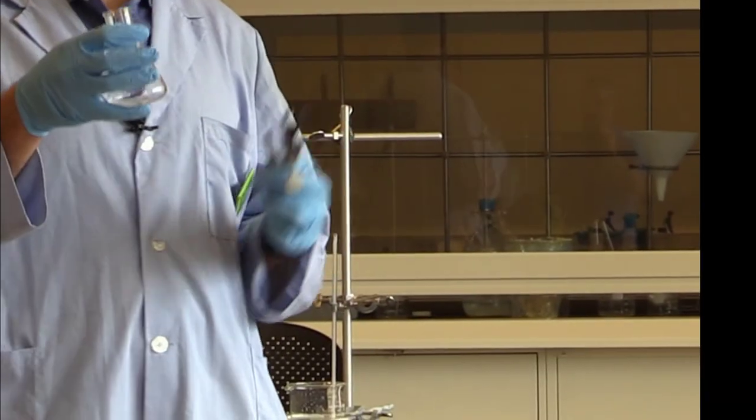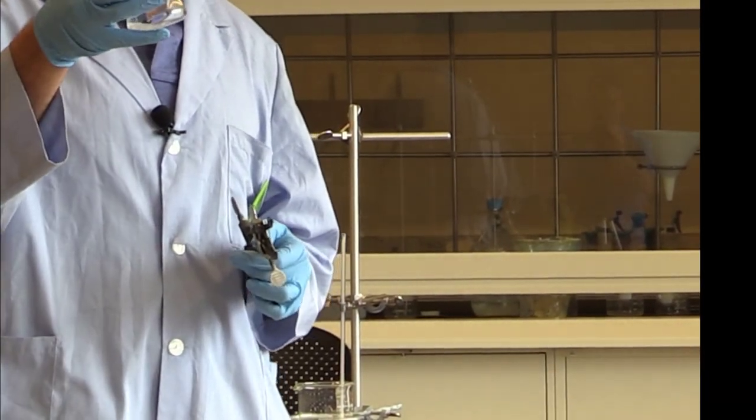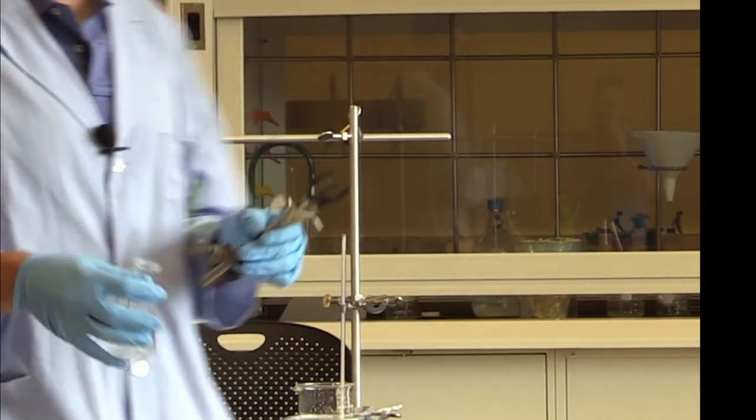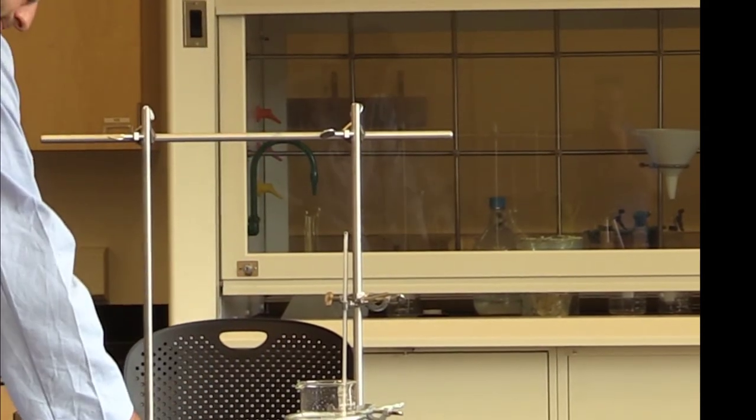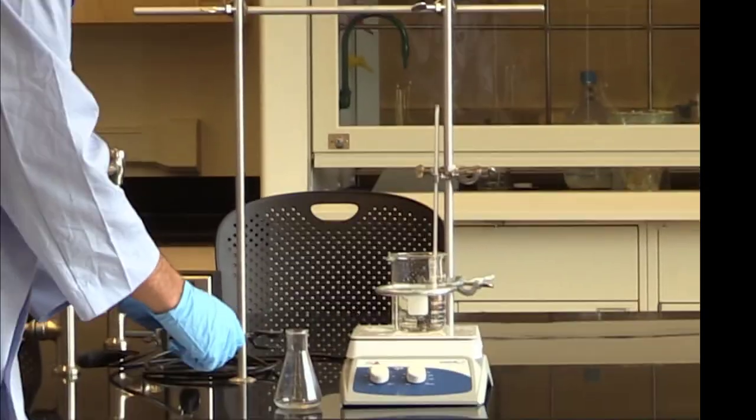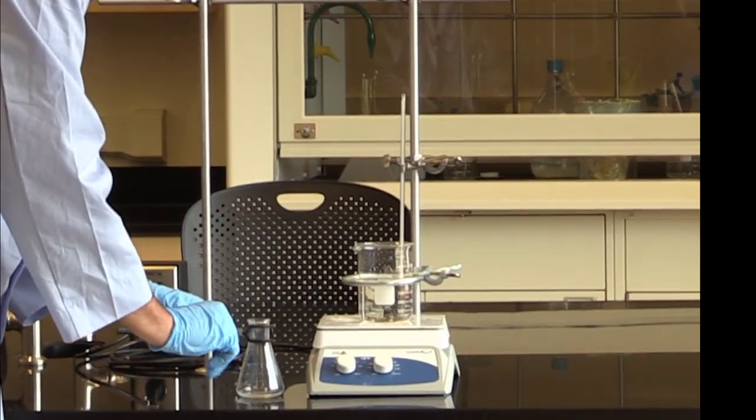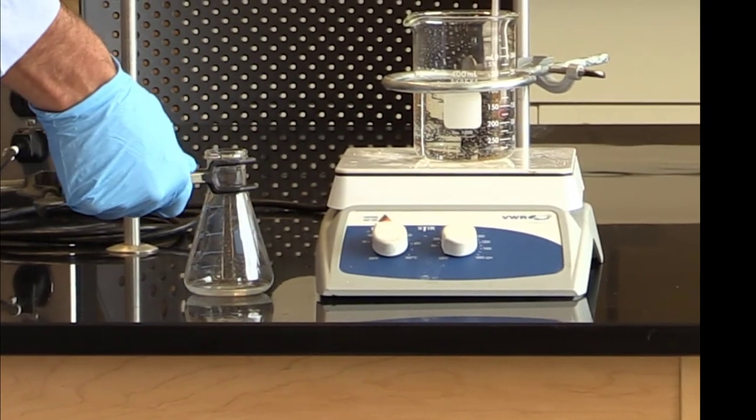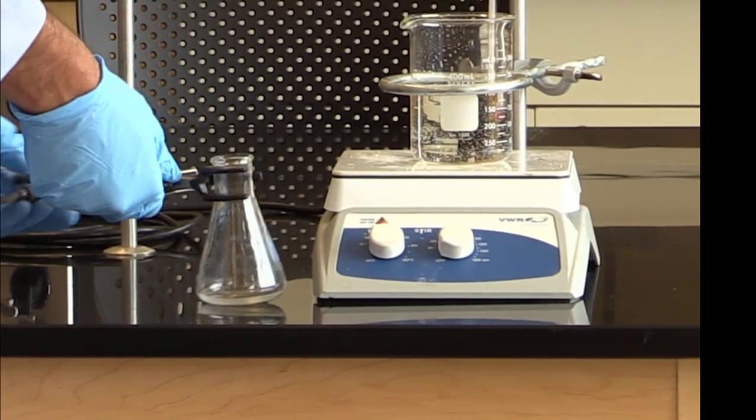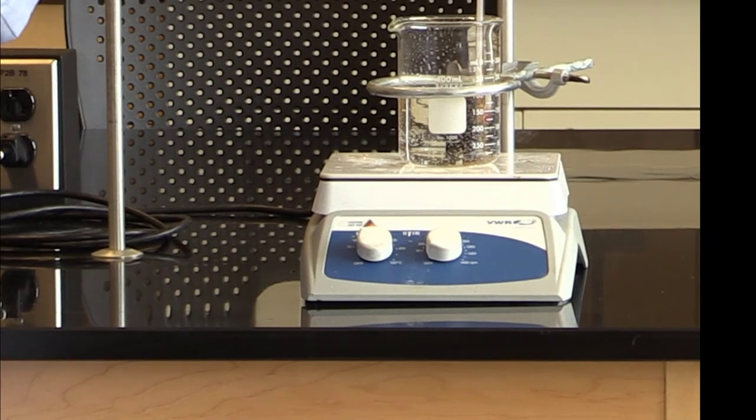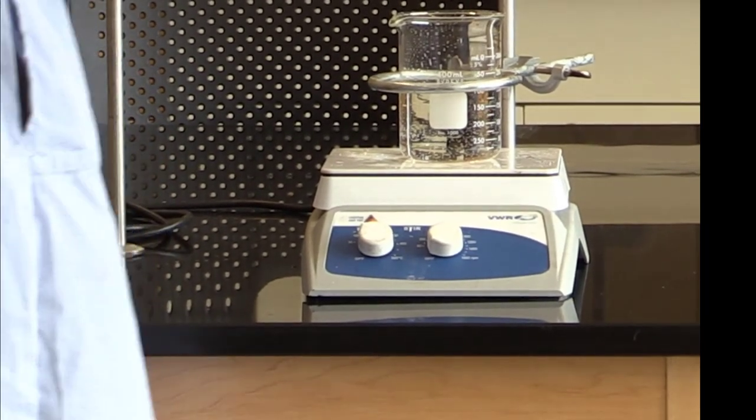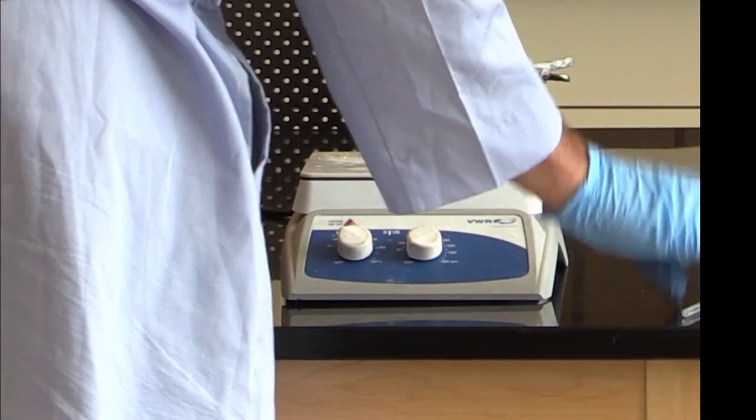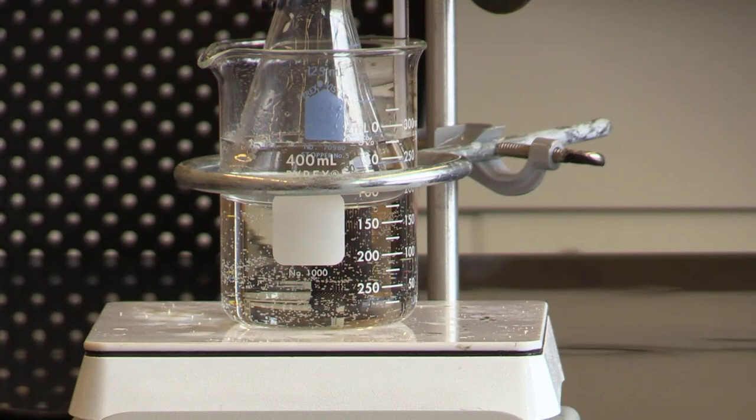This is how we're going to put our Erlenmeyer flask into our water bath. We're going to take a clamp. First clamp it outside of the water bath. We will remove the thermometer so we don't break it. Now we have our apparatus fully set up.